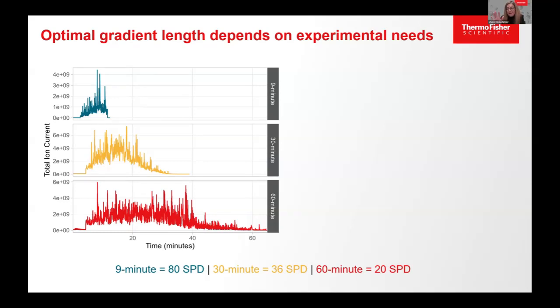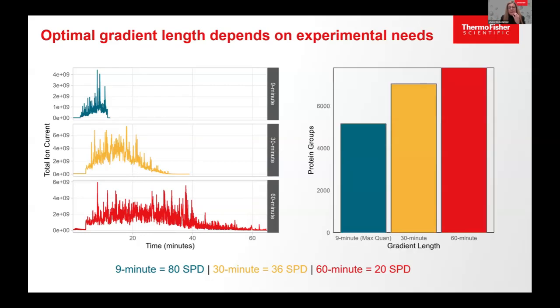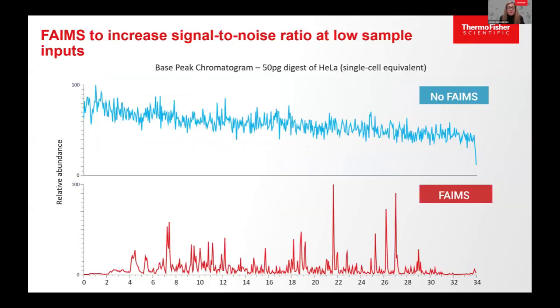However, you can change the chromatography and go a little bit faster. And this is the type of performance you get even with 200 nanograms of the HeLa digest DIA method. It's pretty impressive, and this is even on the Ascend system and the Tribrid, not on the Astral.